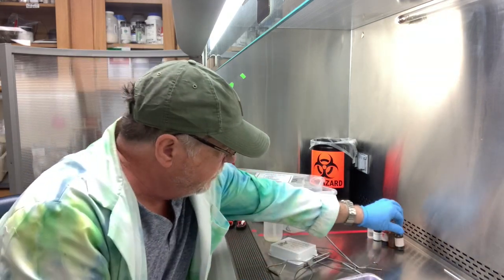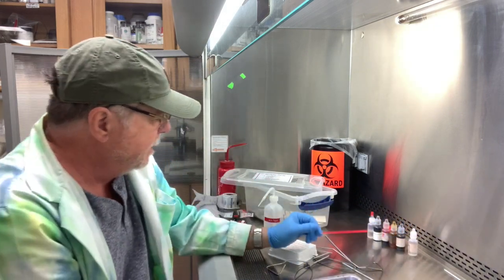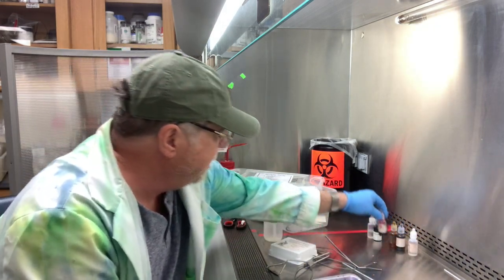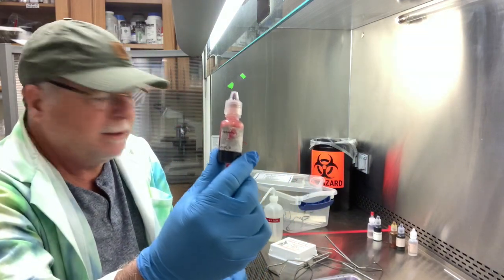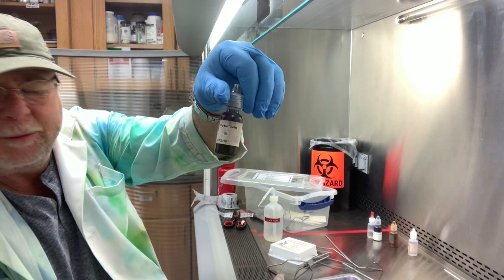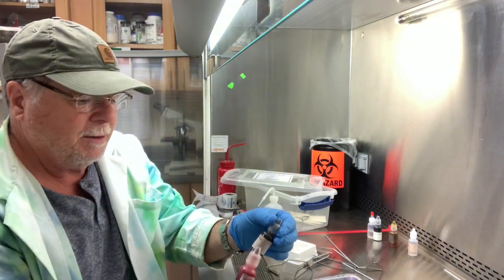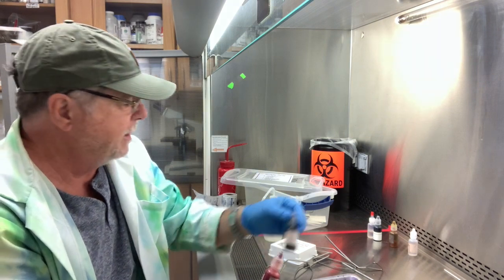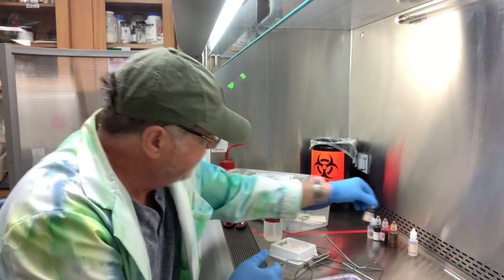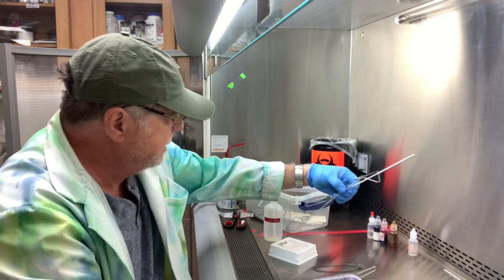For this lab, all we need to use is either a pink stain, safranin, or the purple stain, crystal violet. 50-50, I think I'll go with crystal violet. All right, put all this stuff back.